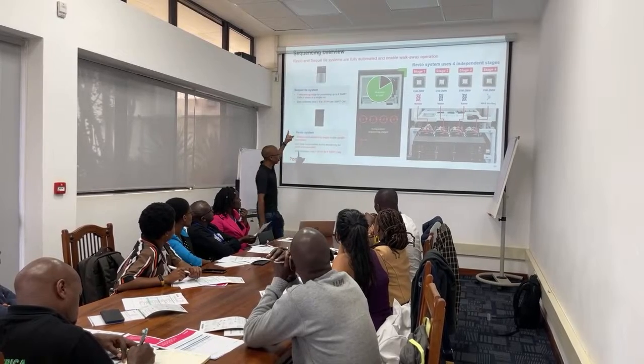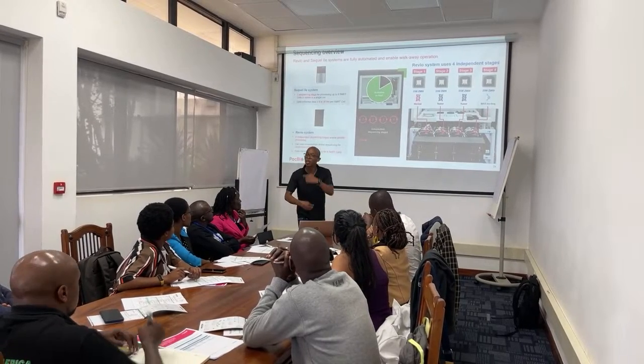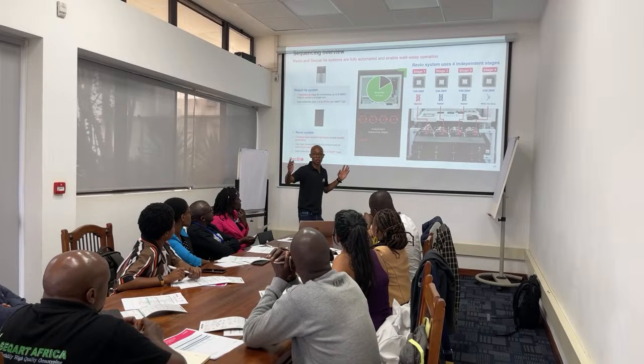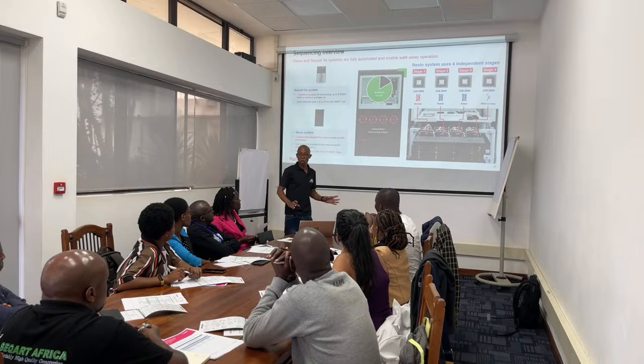And then the difference with that one is it's sequential. If you have 4 cells, it's sequential. When the first cell finishes, then the second one comes in, the third one comes in, the fourth. So you can end up running for straight 7 days, right? Whereas with this one, it's independent. So if you load 4 genomes all at the same time, they will finish in 24 hours. They're all finishing in the same stream.